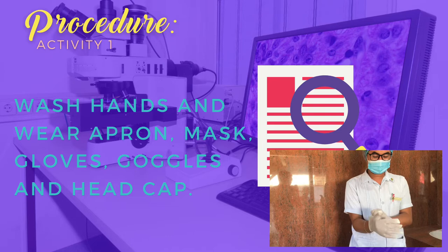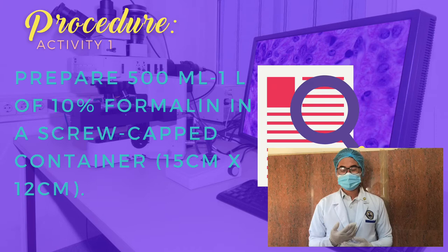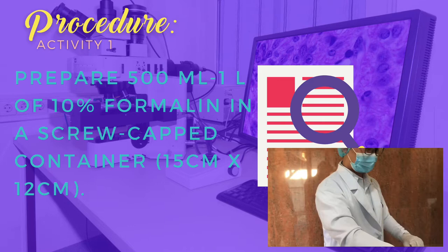Next procedure: prepare 500 ml to 1 liter of 10% formalin in a screw-cup container. In this case, we will be using vinegar.